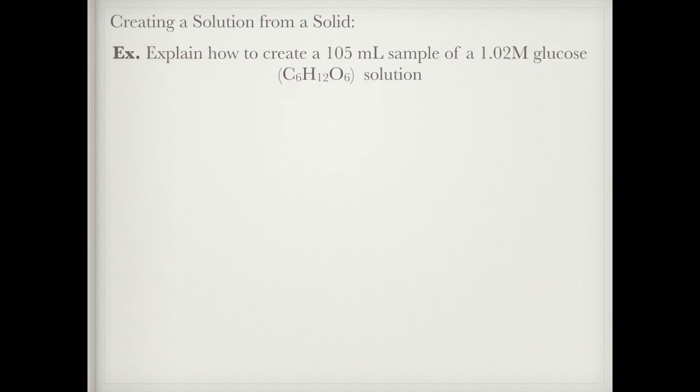In this lesson, I'm going to explain how to create specific types of solutions. The first type of solution is if I go into my prep room and I've got a solid and I need to make an actual solution. So let's look at an example and see what I'm going to do.